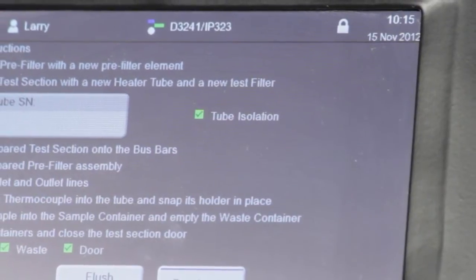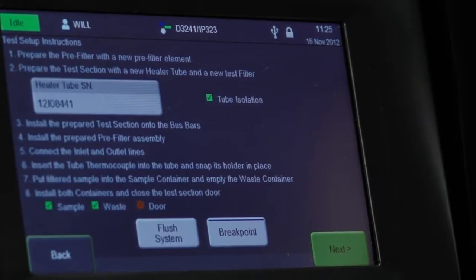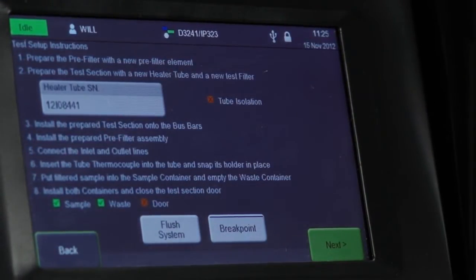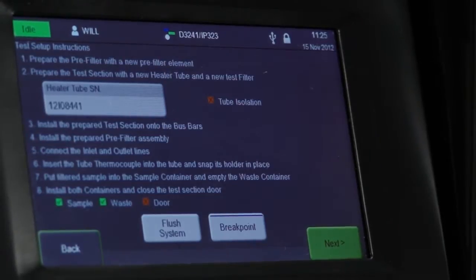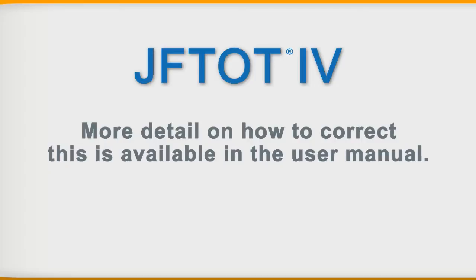Check the status of the tube isolation. If there is an electrical short between the heater tube and test section, you'll be able to see this on the screen. If you see this indicator, you'll need to correct it before moving to the next step. More detail on how to correct this is available in the user manual.